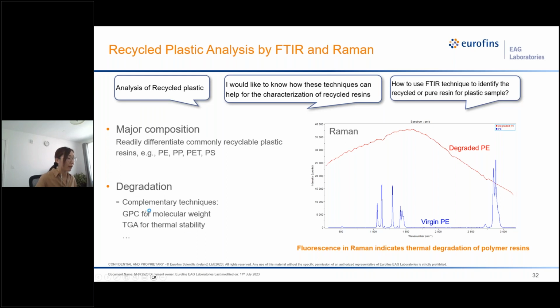Aside from Raman, we have complementary techniques, including GPC, which can be used to characterize the molecular weight of the polymer resins, as well as TGA, which can be used to study the thermal stability. So all those different techniques provide useful insight into the degradation in polymer resins.